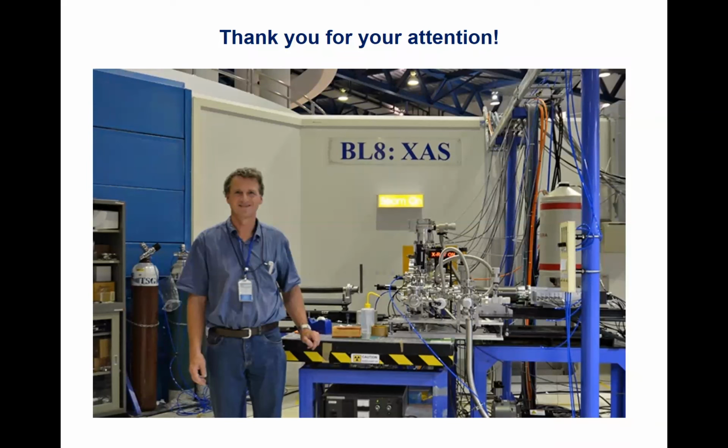I agree. Yeah, what we try to do normally is we combine our measurements with a sequence of increasingly concentrated standards. And then we look at which point of concentration we have a serious change of the spectral patterns. And we try to dilute our samples with boron nitride or with quartz to be well below this critical concentration threshold, at least to assume that self-absorption isn't too big an issue in this case. Of course, we can never completely avoid it. I mentioned this because of micro concentration effects and so on.